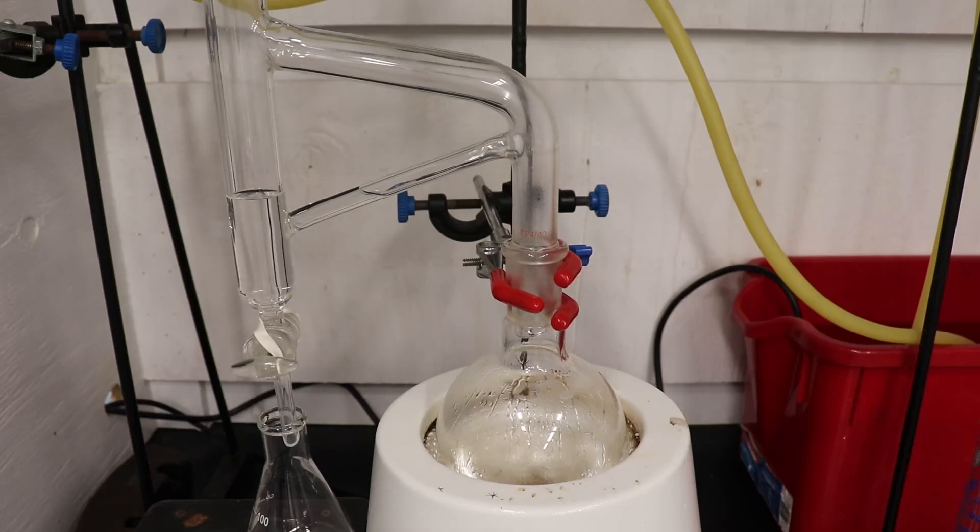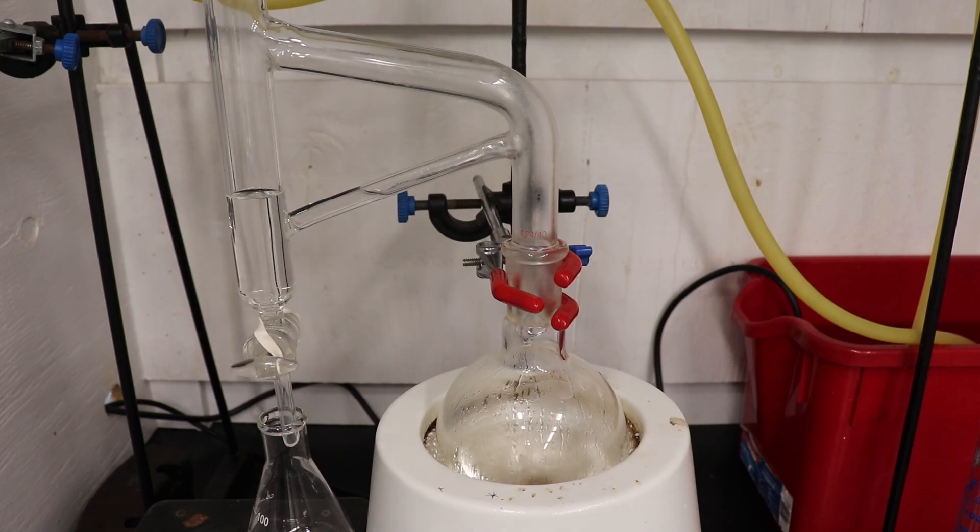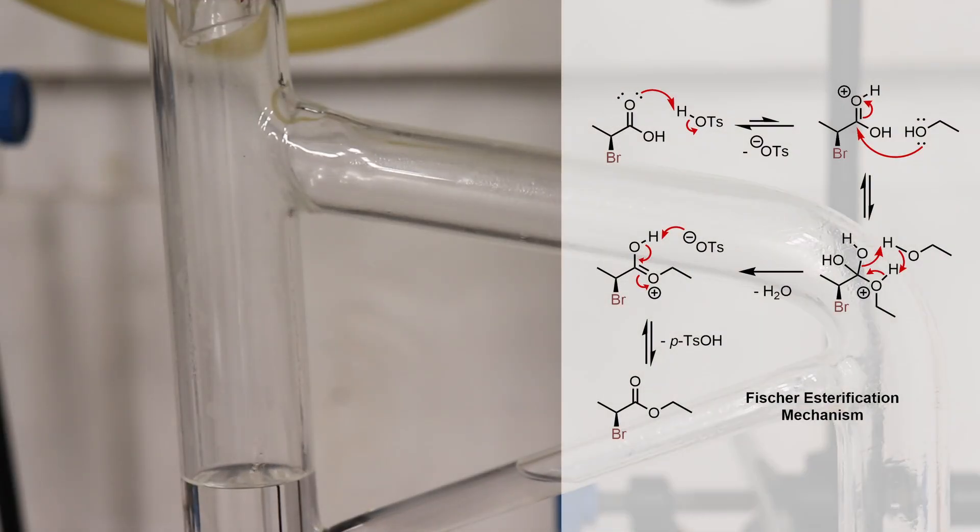After some time, vapors can be seen rising up through the arm of the Dean-Stark apparatus. The purpose of this setup is to separate out the water that is formed during the esterification.